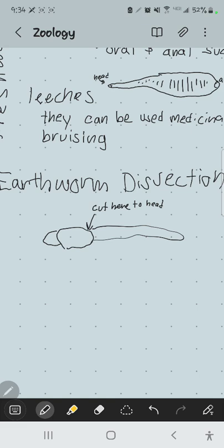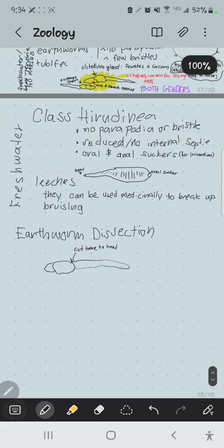Okay, so let me go ahead and, the cross-section picture there basically is showing what you need to see in your cross-section. There's more in the cross-section than what I'm going to ask you. Basically, I'm going to limit it to coelom and typhlosole. It's the main thing I'm interested in. And the coelom is of note because it's entirely lined with mesoderm. That's the question there.